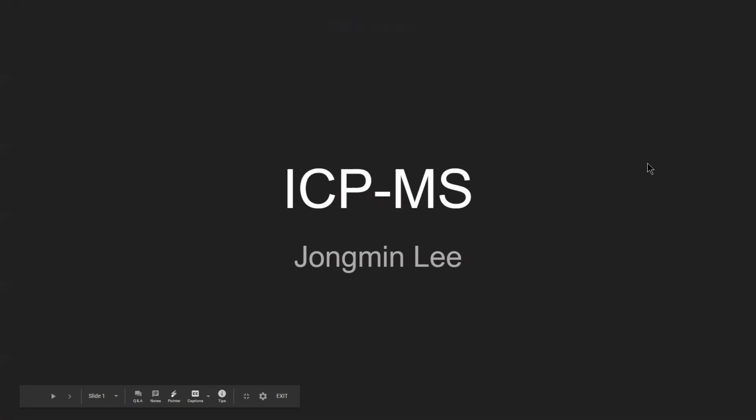I am part of Urban Ecosystem FRI Lab, Team Ruth, researching in ICP-MS Lab. I'll be introducing what I am researching in this ICP-MS Lab, what instrument is used, how we analyze the data, and where the results can be used.